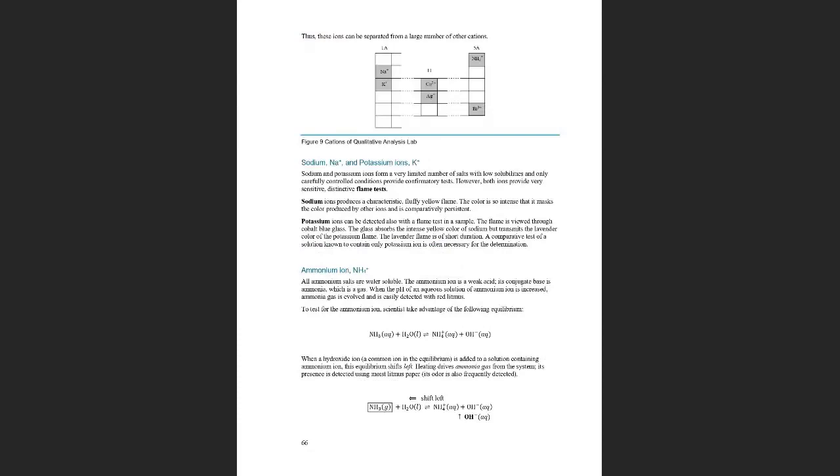Okay, silver ion. When you add hydrochloric acid, no, the previous one. Okay, so right here, no. Okay, that's okay. The first reaction, when you have silver ions and you add hydrochloric acid, the first thing that will happen is a white precipitate that is a solid of silver chloride.